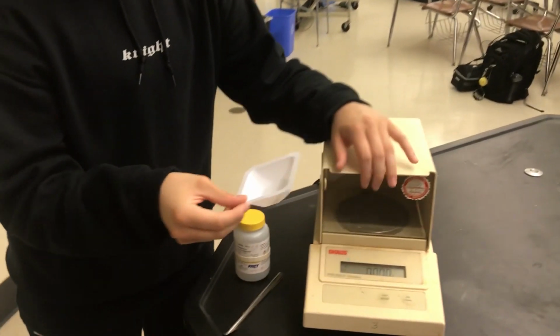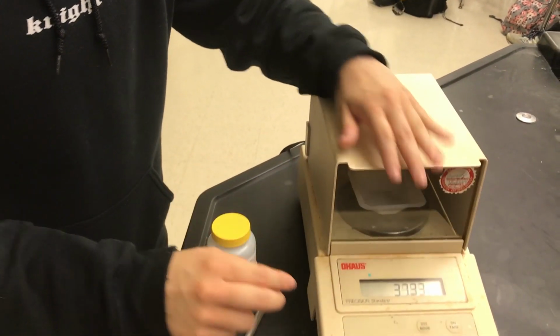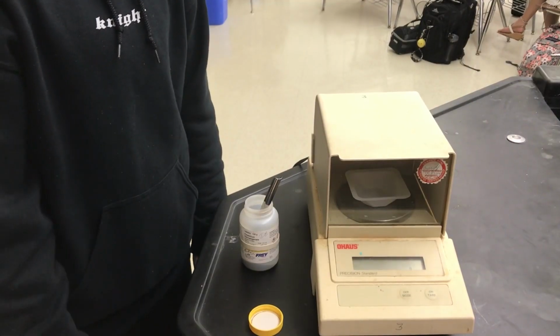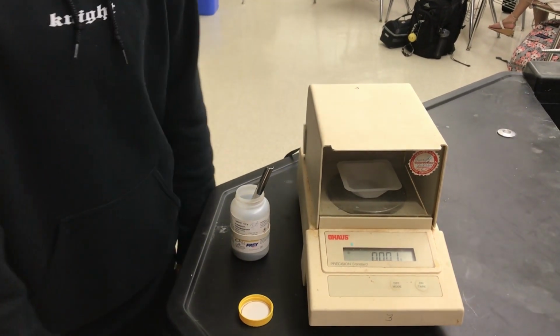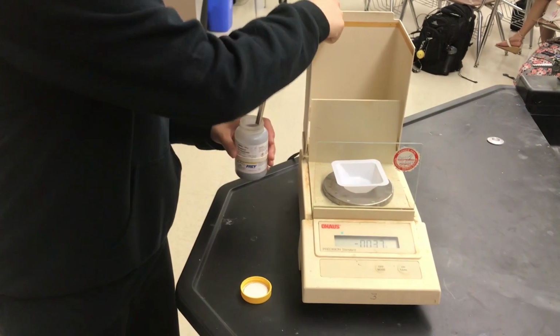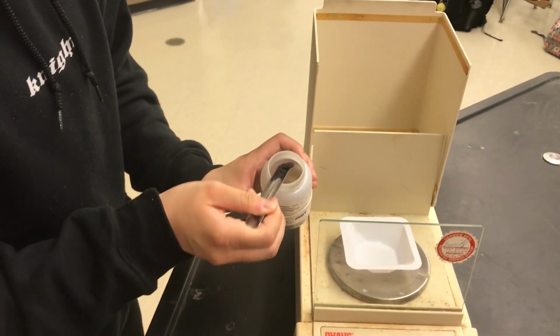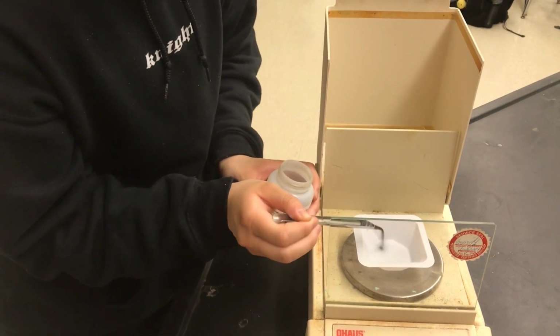So we put the weigh boat into the scale, and remember to press tare so you don't accidentally include the weight of the weigh boat in your calculations. Now, we measure. This seems like an appropriate amount.